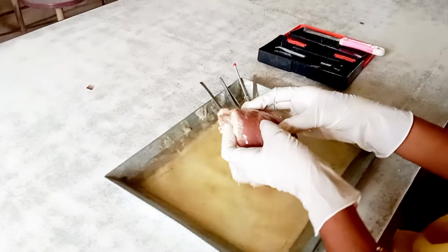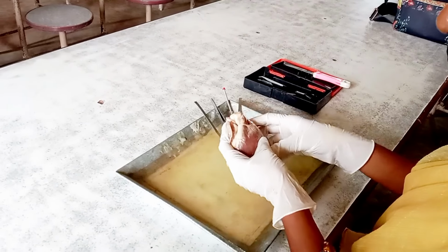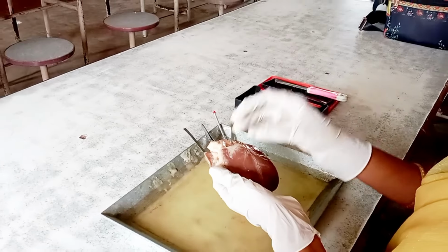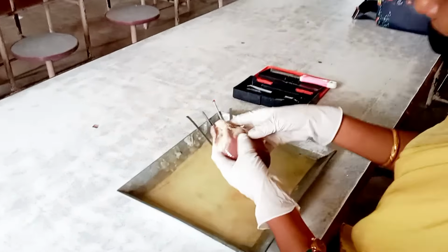Heart is not simply arranged in the chest cavity, but around this there is a fibrous double layered sac which provides structural support and protects the heart from infection, trauma, and also minimizes friction during heartbeats. Moreover, it is filled with the pericardial fluid which protects the heart from mechanical shocks. Color of the heart is a vibrant crimson shade and its size is human fist size. It means everyone's heart is in their fist size.